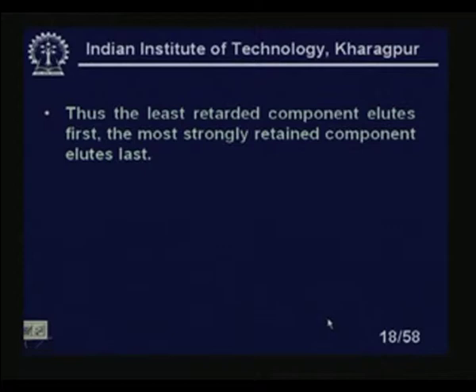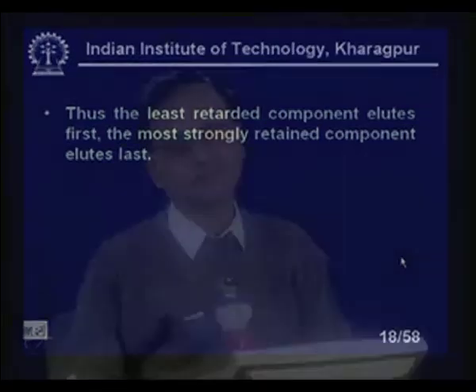Thus, the least retarded component elutes first. The least retarded components elute first, and the most strongly retarded components elute last. It will come at the end, and the least retarded component will come first.